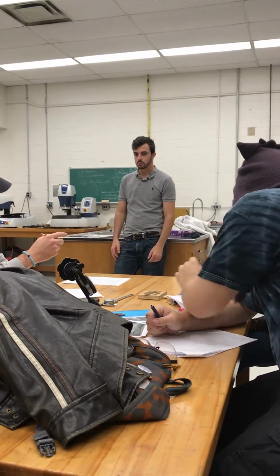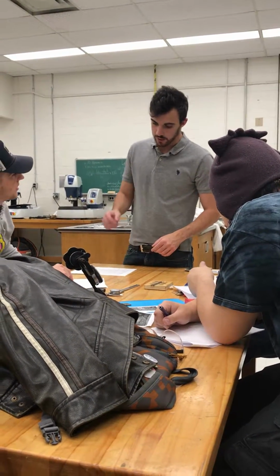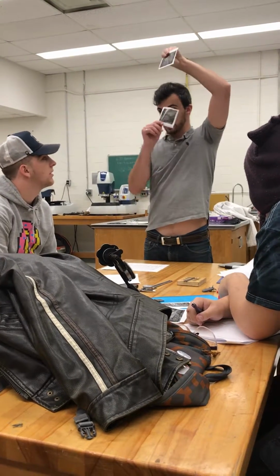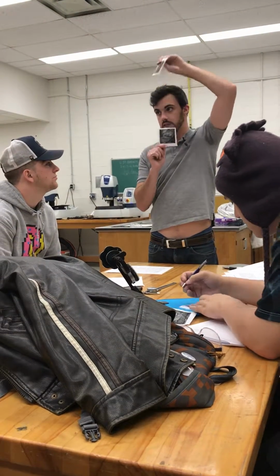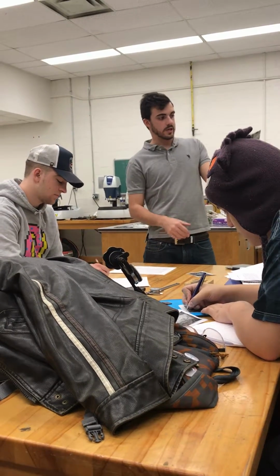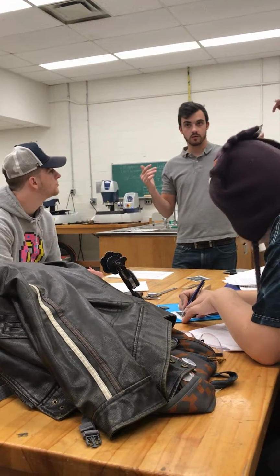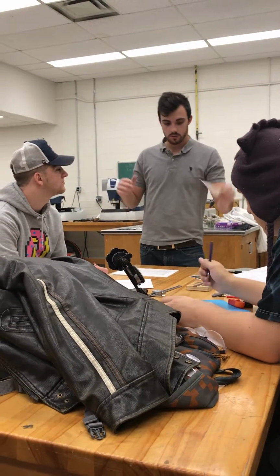Let me see these pictures. Okay, so this is your annealed, this is your compressed. You can kind of see the difference? This one's clearly compressed and this one's been compressed and then annealed, so you just see equiaxed grains. You see how the grain structure is squished like this, so it's striated? So the direction of the force on this would be in this direction, right? Perfect. So that's clear?